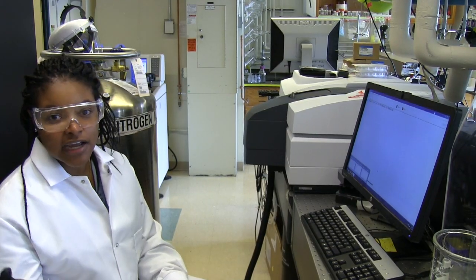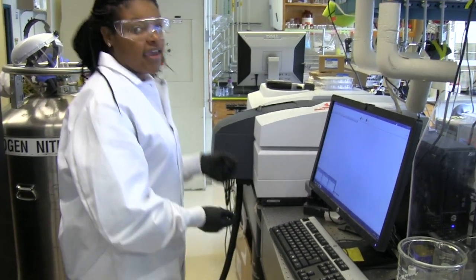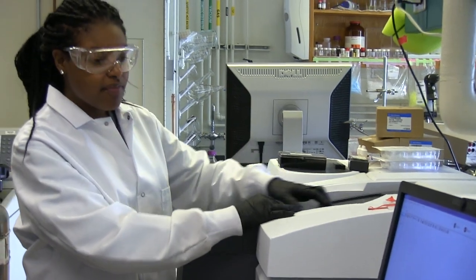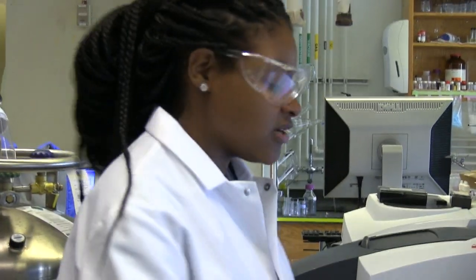I take the samples that I diluted, and then I put them in glass cuvettes, and then we can place them inside of the machine. And then the computer has software that can analyze it and measure the absorbance.